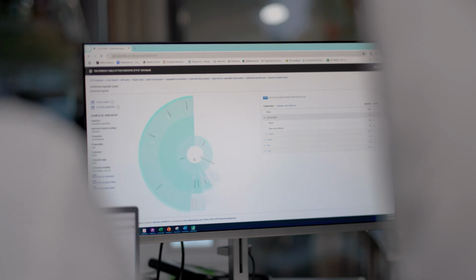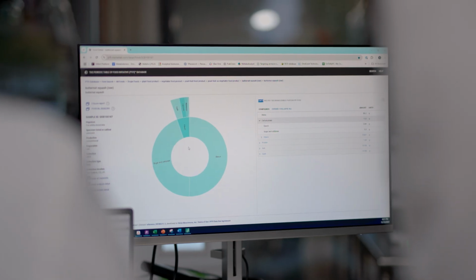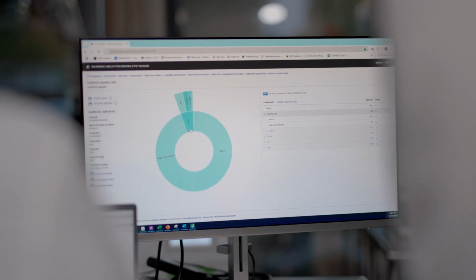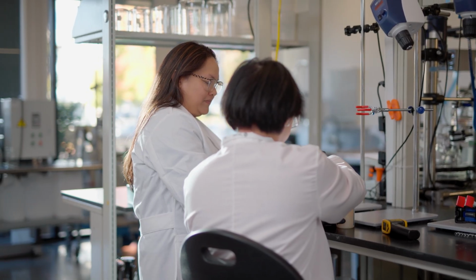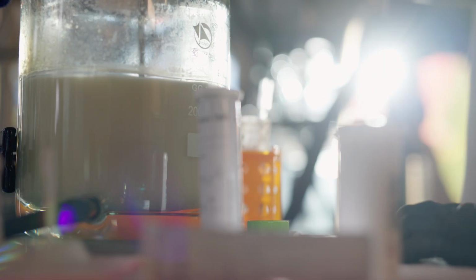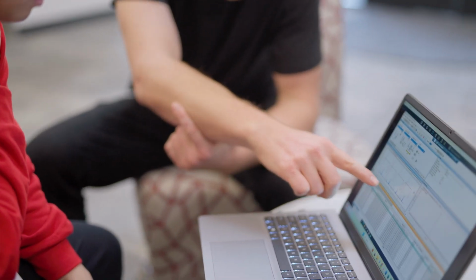After analysis, the data is integrated, which allows us to understand how much sugar, fiber, and starch is found in each food product, enabling us to map those back to a nutrition profile. This new understanding of carbohydrates will enable scientists to understand how the precise molecular structures of different components that make up carbohydrates are able to influence not only our diets, but our microbiota composition, and also how this impacts global health.